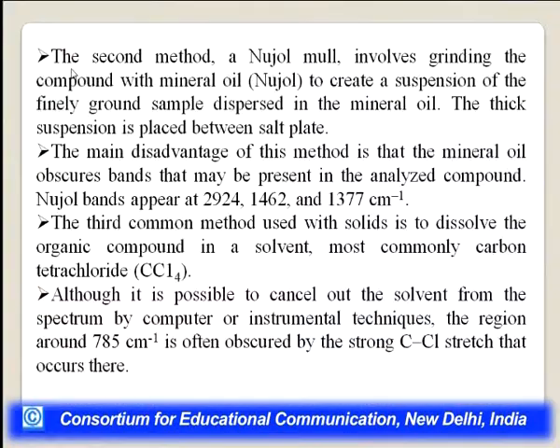The second method for solids, a Nujol mull, involves grinding the compound with mineral oil to create a suspension of finely ground sample dispersed in mineral oil. The thick suspension is placed between the salt plates, that is potassium bromide plates.